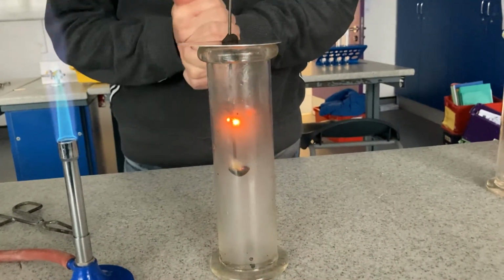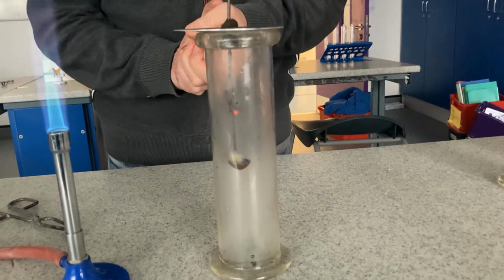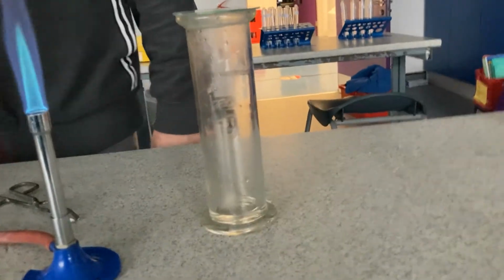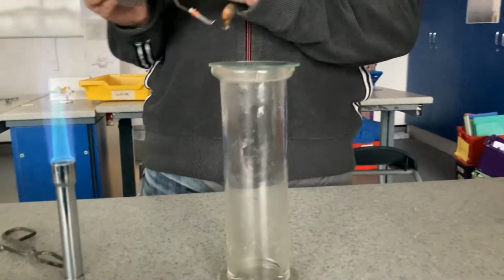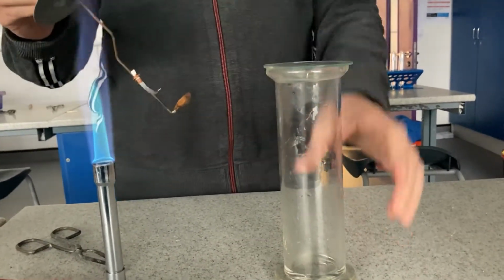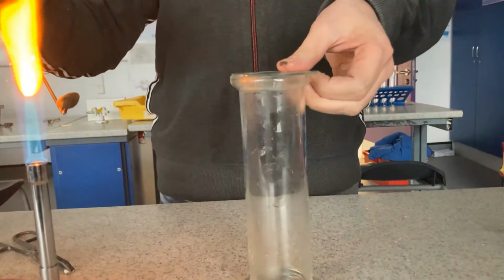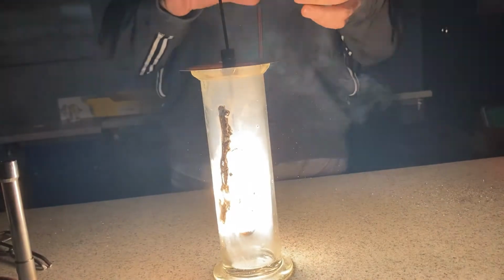I would like to do magnesium, but you've seen what magnesium's like, we can't really be doing magnesium. Oh, sorry. Can we do magnesium? Oh, we can do magnesium. Let's see what that does in oxygen. Yes, of course. Right, got some magnesium here, tied on there. Same deal. I'm going to plunge it into the oxygen to see what it does. Don't mess it up. Go on!